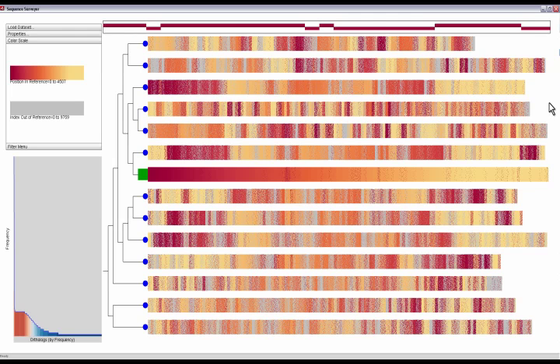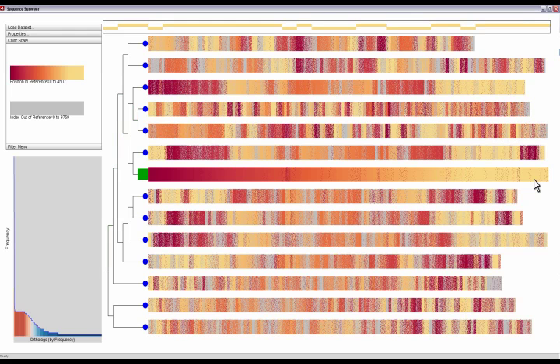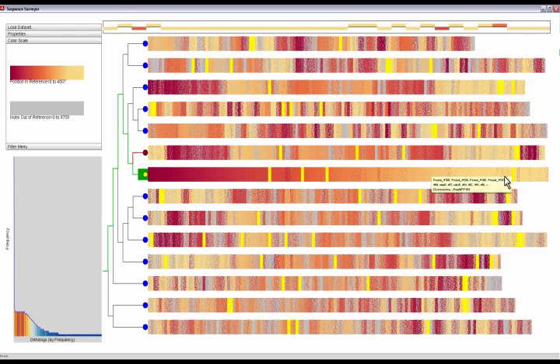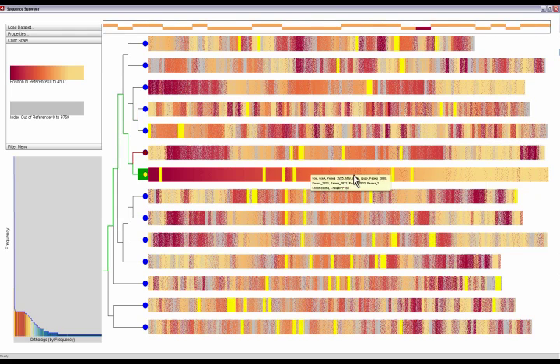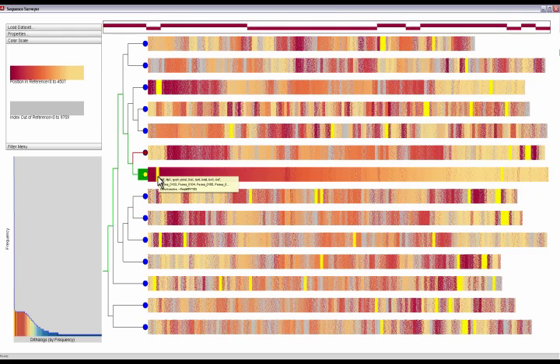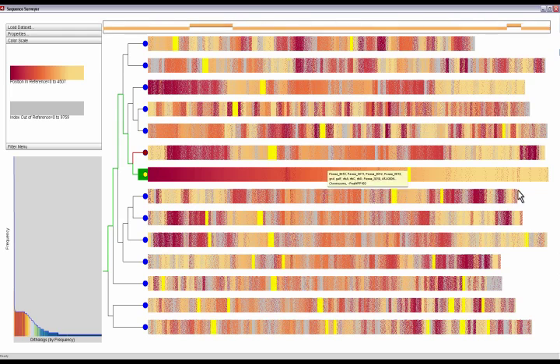Here, we return to sorting by the position in each genome and color by the position in the selected reference. Genes occurring in the reference are assigned warm colors: red if they are at the beginning and yellow at the end.